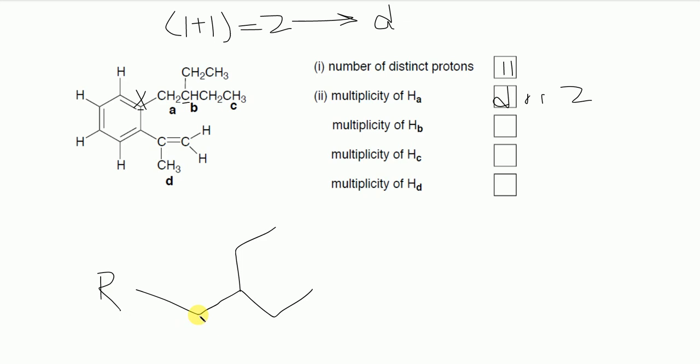Okay, so on each one of these things, I have a hydrogen. I'm just redrawing what we have. Okay, and the bottom one's exactly the same, and then over here I have 2, right? And this one has 1 hydrogen itself, and they're asking for what's the multiplicity of this hydrogen right here.